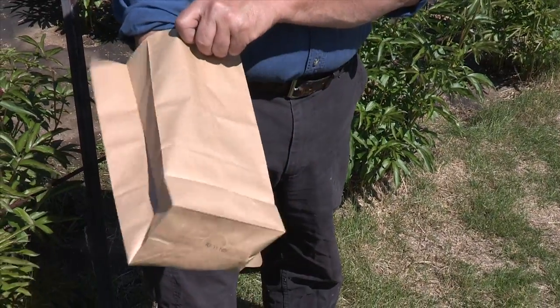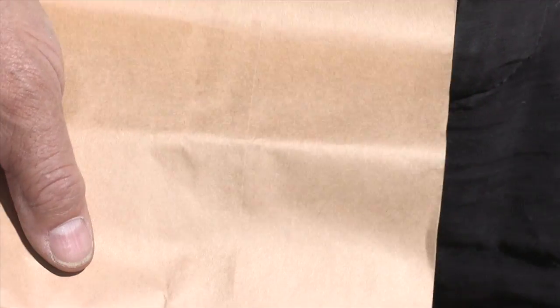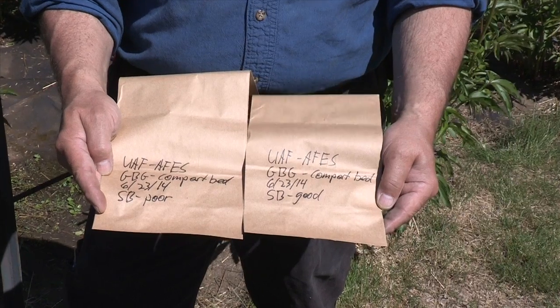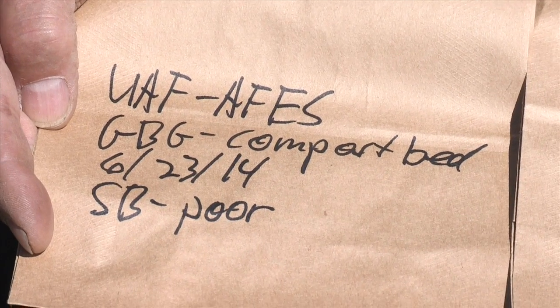Collected leaves are put in the same paper bag. Look for the number grade printed on the bottom of the bag. Paper bags that are labeled number 8 through number 14 work best for sample collection. You should have 2 paper bags, one with good growth plants and one for the poor growth plants.